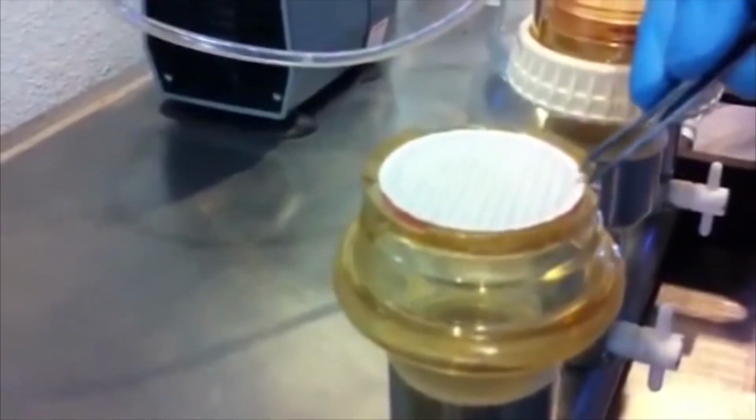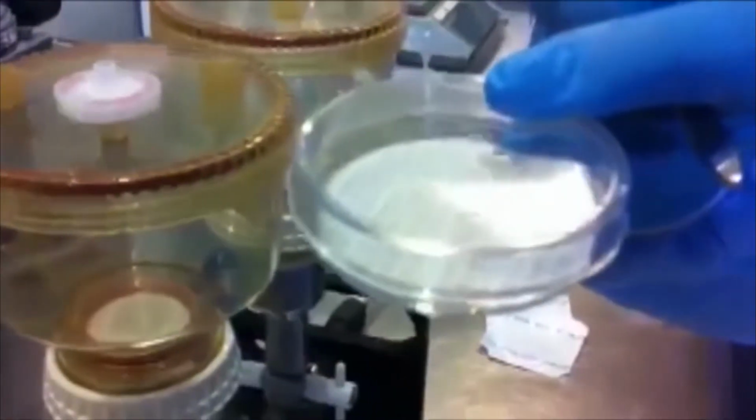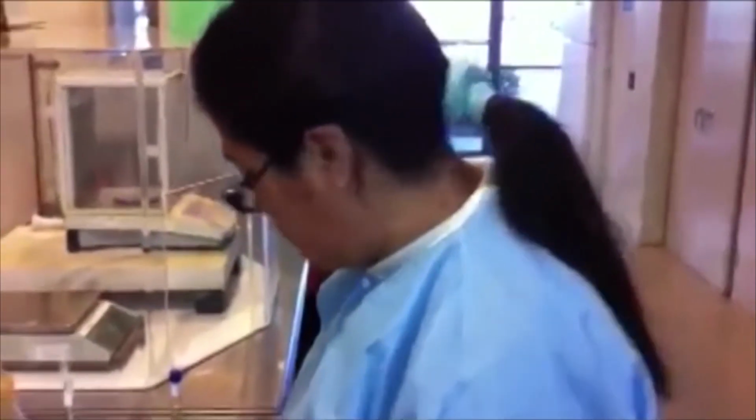And she's going to take off the membrane filter aseptically and add it to the petri dish. And that would be how you incubate them, like that, upside down. There you go. That's why you soak it just enough to soak it. And you can flip it down like that. It'll stick. Okay. It's going to work. Thank you very much. That is your basic lesson in membrane filtration microbiology.